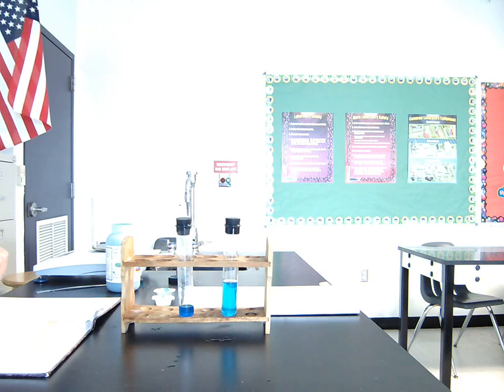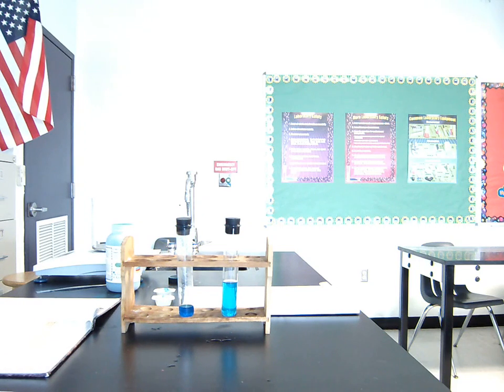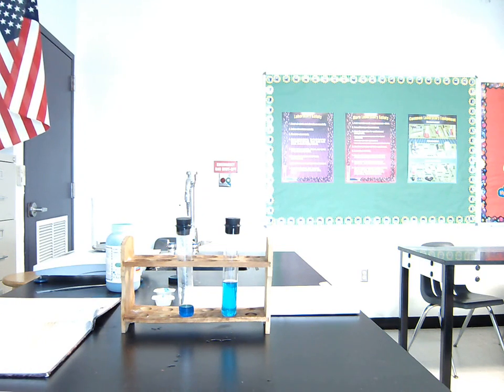The observation at this point is that the 20 cubic centimeter solution dissolves entirely. The 5 cubic centimeter solution has blue stuff left undissolved at the bottom. And then the last blue dot is asking us to do a little bit of math, so let me give you my 2 cents on this. It says, how many grams of blue solid do you think would have to be added to 20 cubic centimeters of water before the solid stops dissolving?